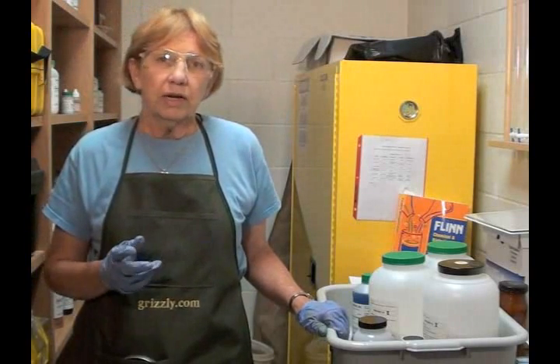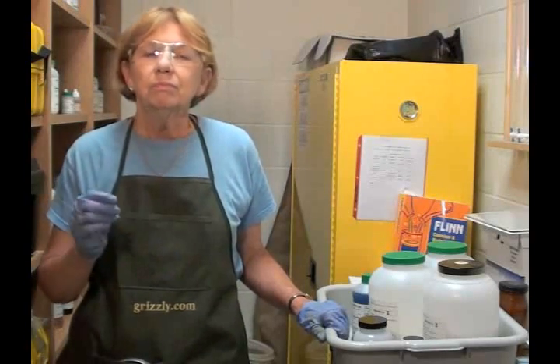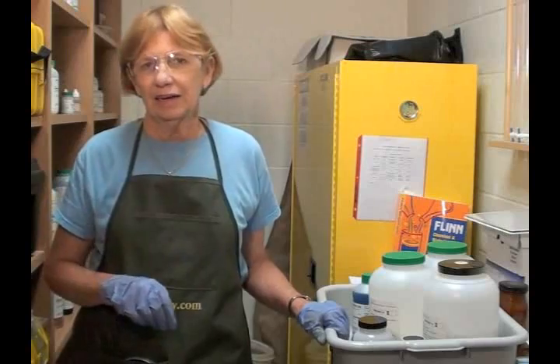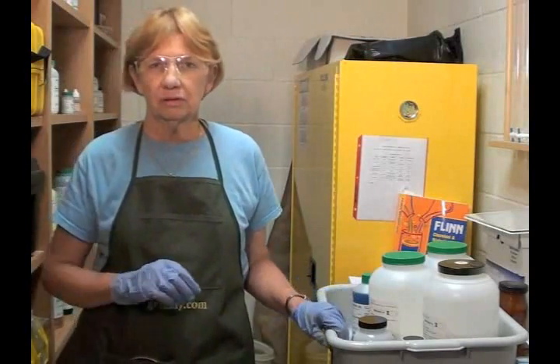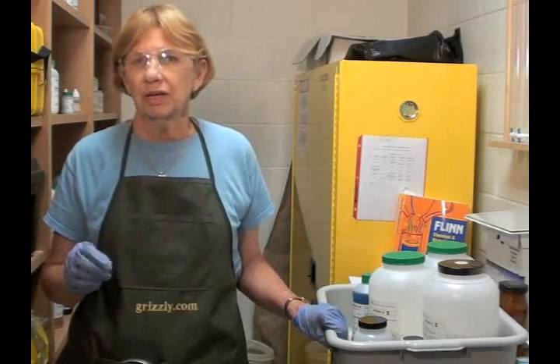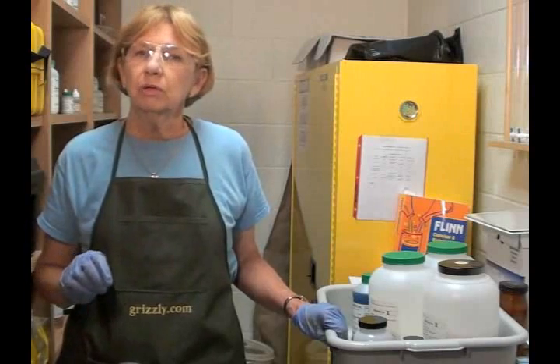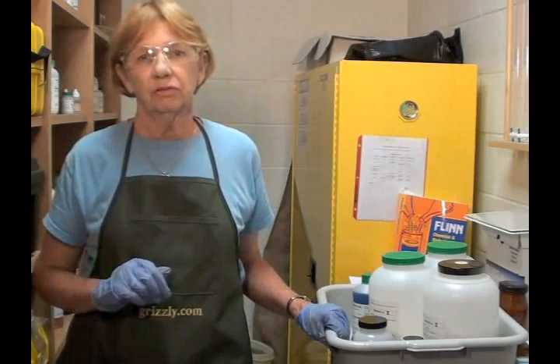You can throw it in the trash if it is a non-hazardous item. Don't just put it in the waste can, however. Put it in a box, mark the box "non-hazardous school chemicals, suitable for landfill disposal," and put your name and number on it. It's preferable if you hand deliver it to the landfill or to your local hazardous waste center.